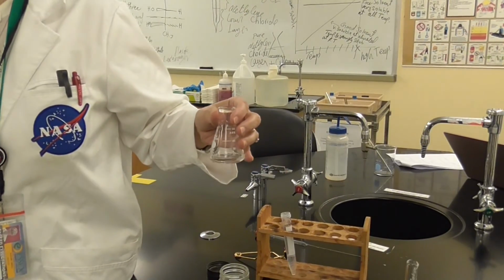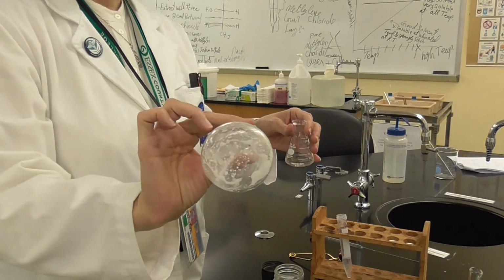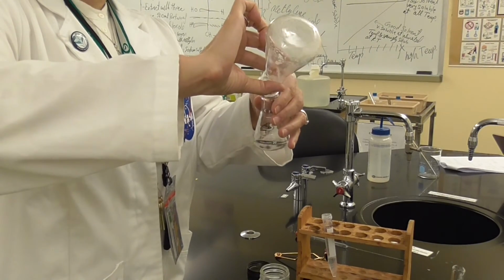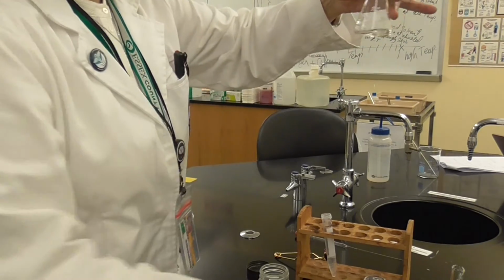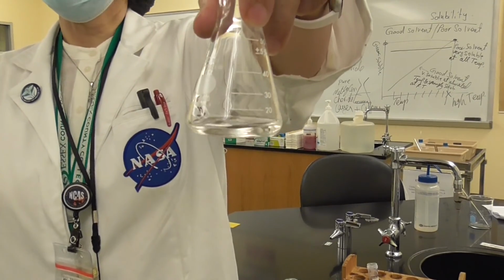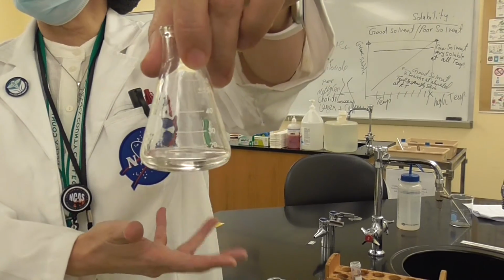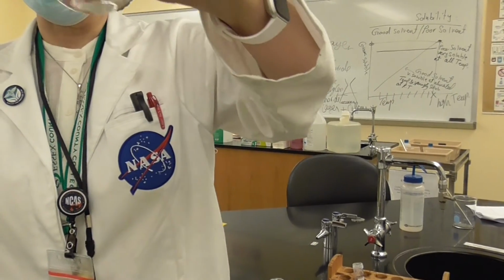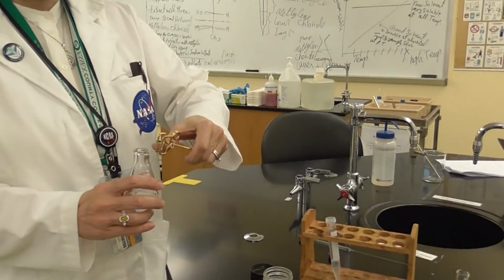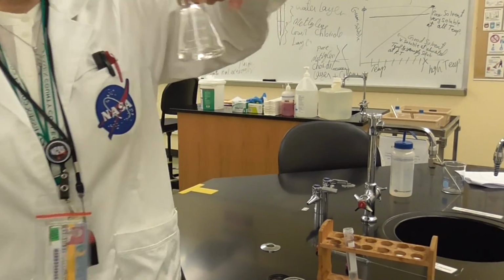You see it, everybody? This is the water with the anhydrous. Now it is hydrous sodium sulfate. I'm going to decant only the, so this is basically a dry organic layer. Technically it is going to have whatever caffeine was extracted from the water layer into the organic layer with methylene chloride.